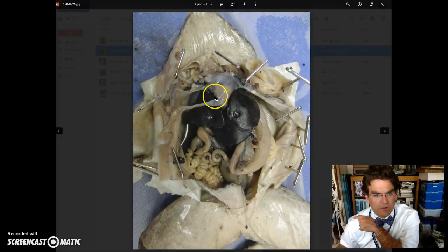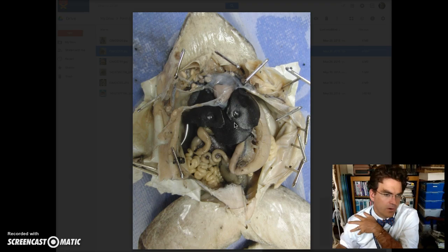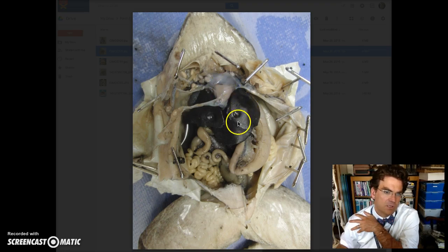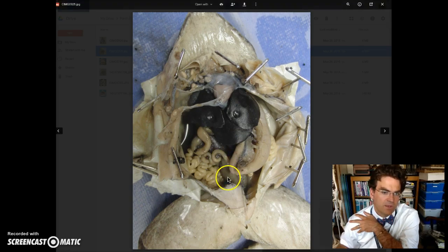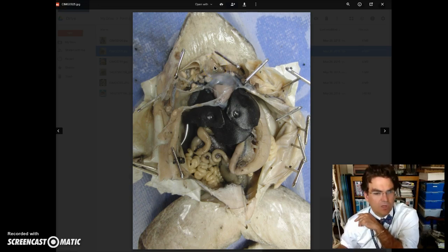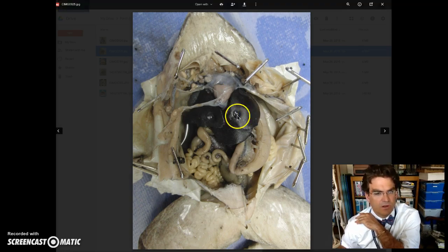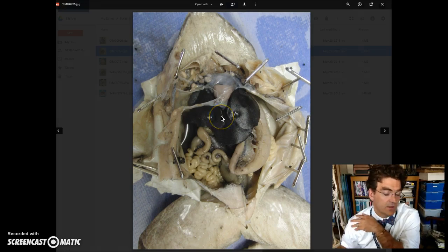Here we can see a little bit better. This is that same frog, but the livers aren't lifted up, so we can't really see the lungs nor the gallbladder in this picture. But right here is your heart. You've got your heart, you have your liver, you have your stomach, and you have the small intestines as they curl around. Here you have your large intestines, and you do have the esophagus right here — that tube right there — so the stomach comes in and goes right there. The only organs you don't have in this picture are the lungs and the gallbladder, so if you use the internal parts of the frog, you would need to use two pictures.